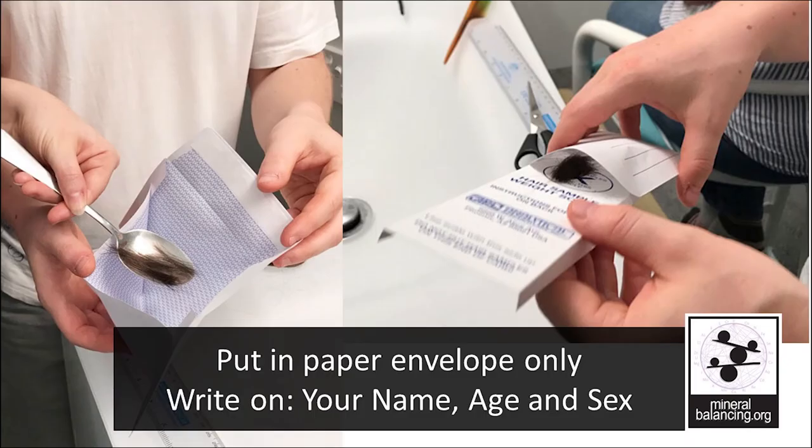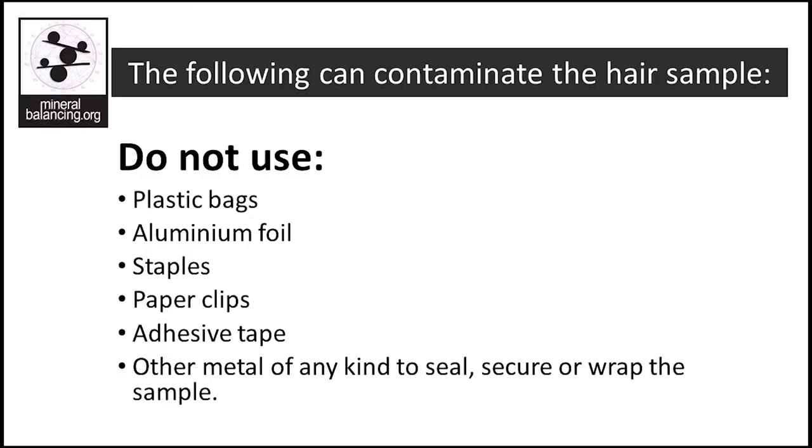Once you have enough hair for your sample, put it in a paper envelope that has your name, age, and sex on it. A regular letter envelope works well. Afterward, fold it in half and place this folded envelope into the other envelope that contains your order form provided by your practitioner. Samples will not be accepted without an order form. If you have a hair kit, place the sample directly into the small paper envelope provided, which is then put inside the postal envelope also provided. Do not place your hair sample into a plastic bag or within aluminium foil — only use clean paper envelopes. You should also avoid paper clips, staples, and adhesive tape. Try not to use any other metal of any kind to seal, secure, or wrap the sample.